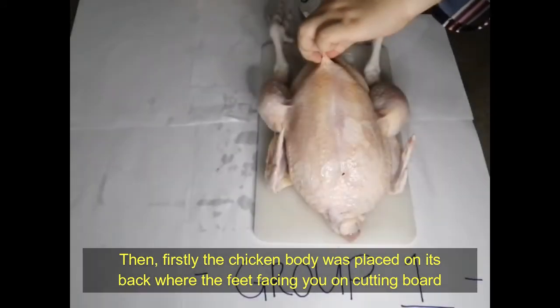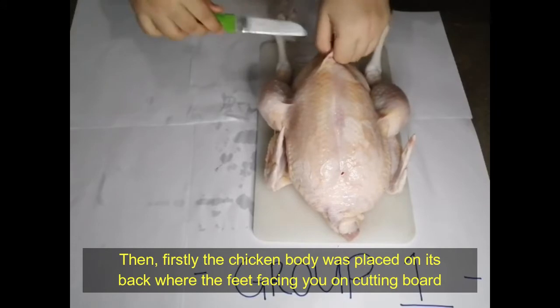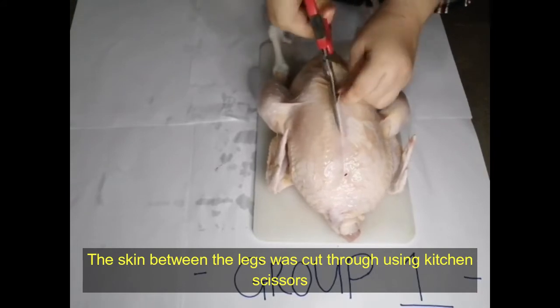Firstly, the chicken body was placed on its back with the feet facing you on the cutting board. The skin between the legs was cut through using kitchen scissors.